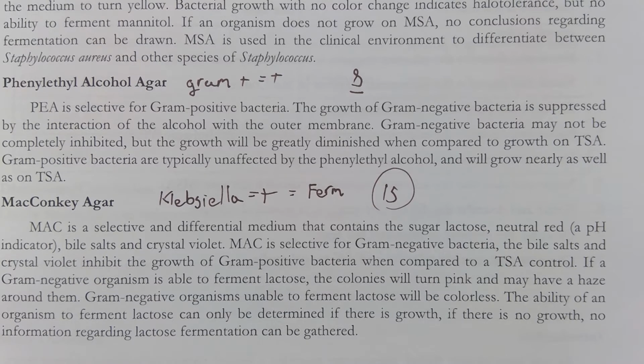If a gram-negative organism is able to ferment lactose, the colonies will turn pink and may have a haze around them. Gram-negative organisms unable to ferment lactose will be colorless. The ability of an organism to ferment lactose can only be determined if there is growth. If there is no growth, no information regarding lactose fermentation can be gathered.